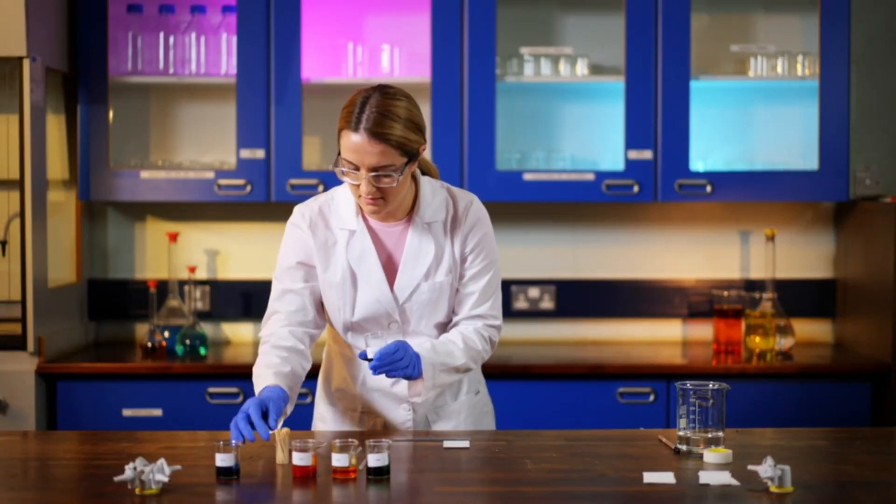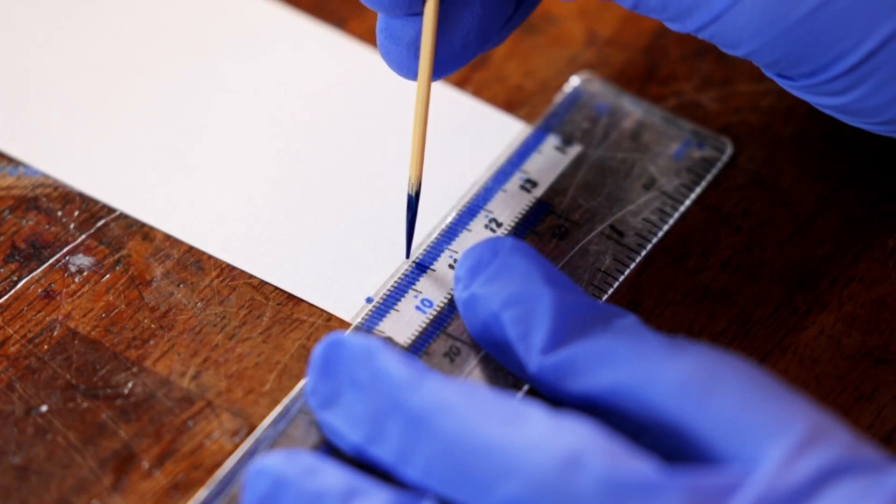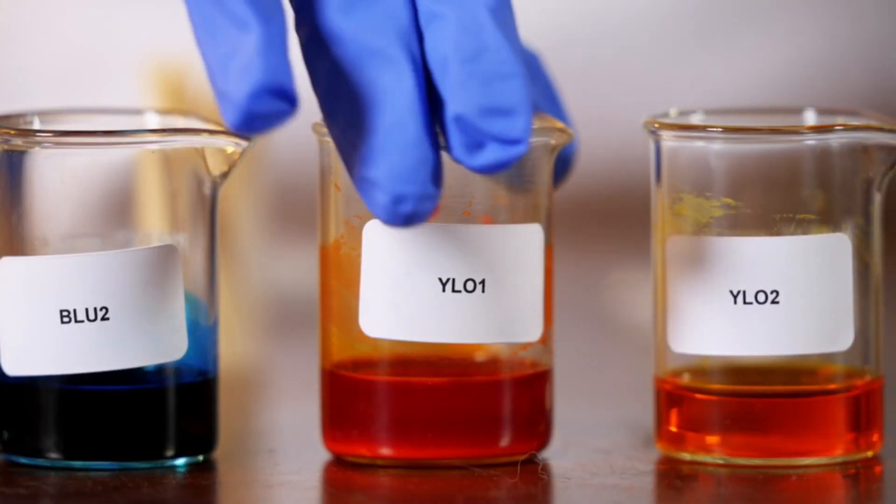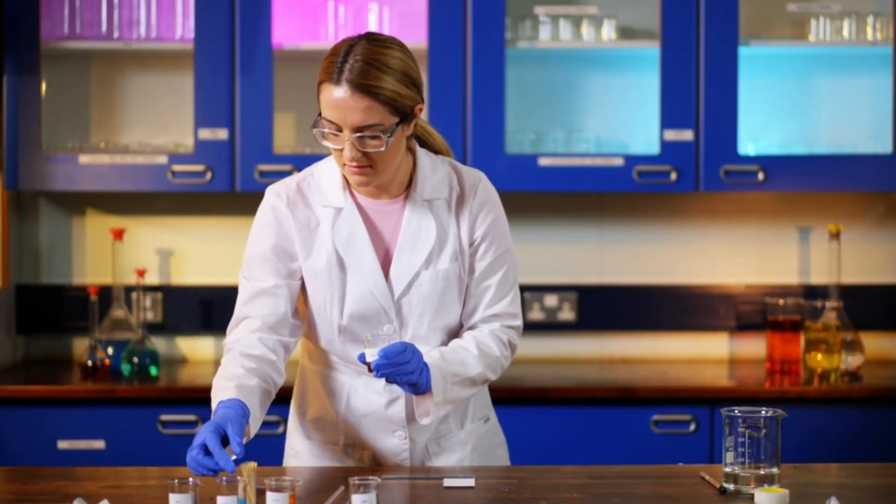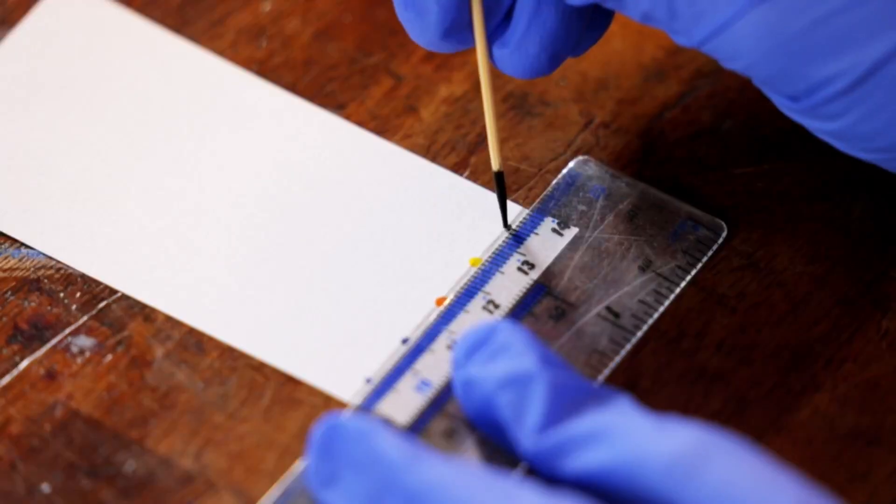Now dip a second toothpick into the next food coloring. For us it's blue two. Leave about a one centimeter gap between each dot. We repeat this with yellow one, yellow two, and then finally with our green food coloring.